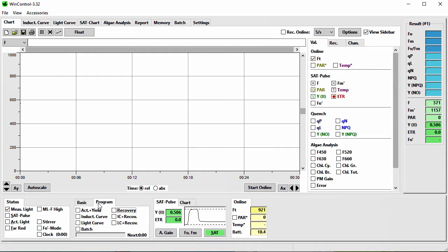In the Program tab are various experimental routines listed: Actinic Yield is a period of Actinic Illumination terminated with a Saturation Pulse; the Induction Curve Protocol without or with recovery; the Light Curve also without or with recovery; and an option to execute a preselected batch file. Activating the checkbox will start the respective program.